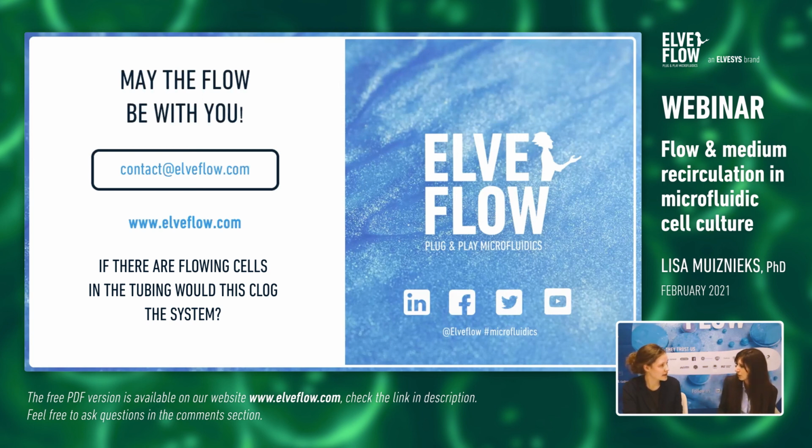You have a comment about blood? Yeah, well, actually, with circulating blood, the idea is to use some stirring and add eventual anticoagulants, like heparin and so on, to keep the blood fluid, to avoid, of course, these clogging issues.